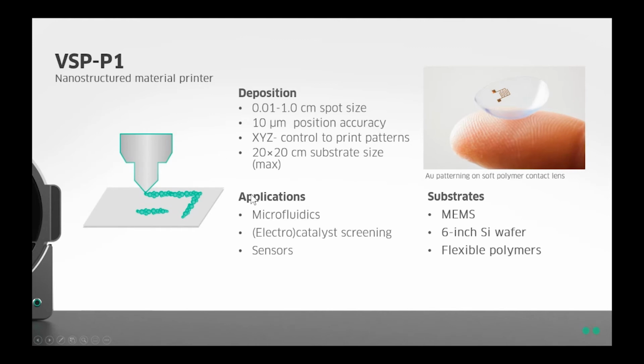Applications, there are numerous, but some applications that we are currently working on are printing these advanced materials in, for example, microfluidic devices, high throughput catalyst screening, I will give an example of that, but also advanced sensors.